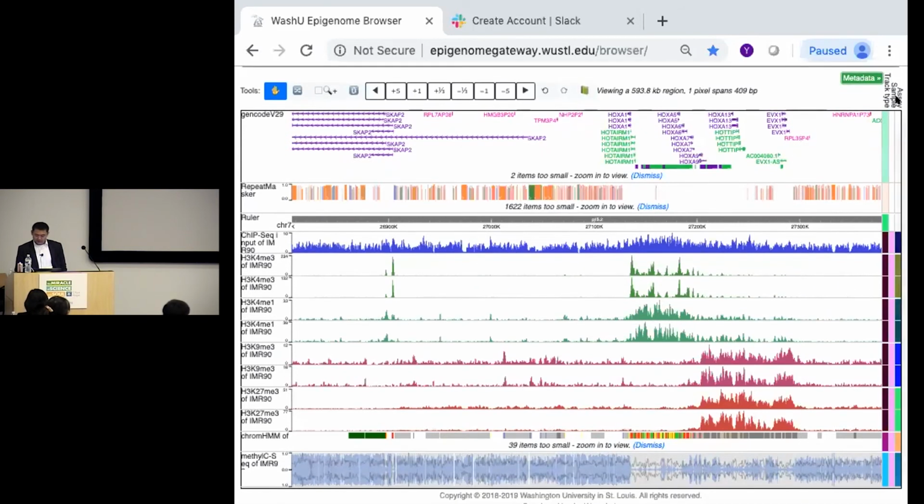Now you see I added another map on the side, and this map is displaying the metadata of the genomic data. I have track type, so I have bar graph, that's the track type here. This is a Methyl-C track, something I'm going to tell you a little bit more about. This is actually how we display whole genome bisulfite data.